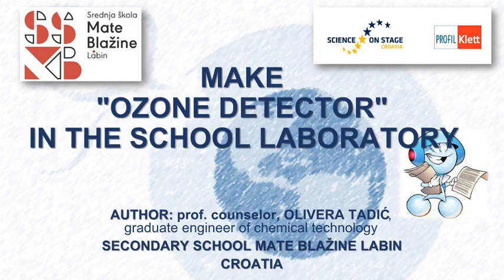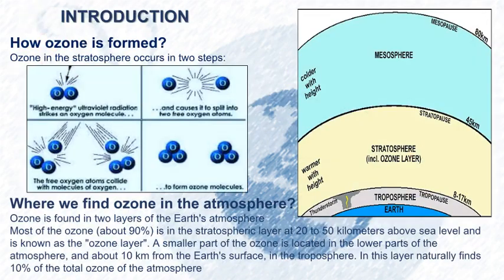Hi, I'm Olivera and I'm going to present to you a project: making an ozone detector in the school laboratory, which was created on the initiative of my students within the framework of activities aimed at taking care of climate change. For an introduction, something about ozone.